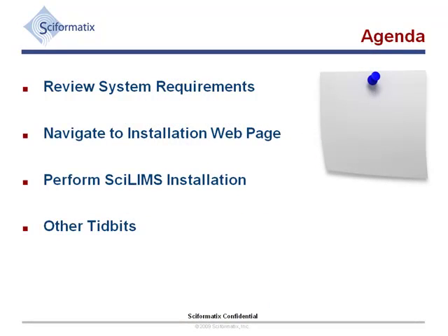Before we begin, let's review what we will cover in this training session. First, we will review the SciLIMS system requirements. Next, we will navigate to the SciLIMS installation web page from which the installation will be performed. Following that, we will perform the installation. Finally, we will take a look at some other tidbits of useful information.